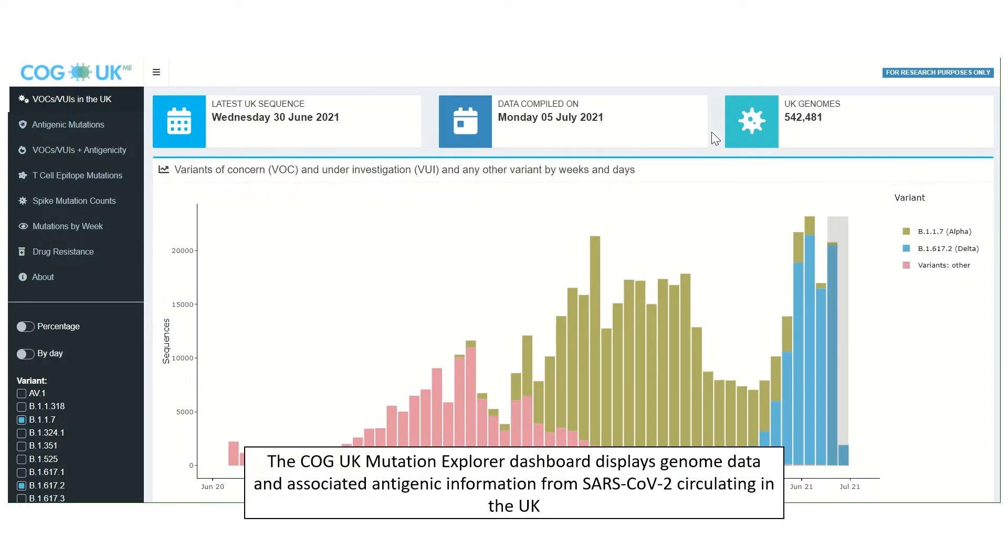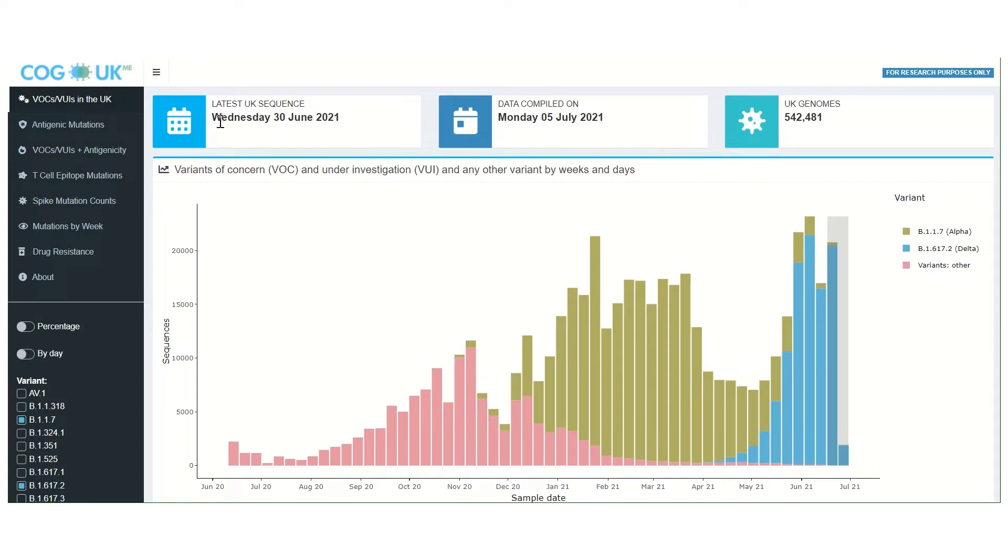The COG-UK Mutation Explorer dashboard displays genome data and associated antigenic information from SARS-CoV-2 circulating in the UK. Daily sequence data updates are summarized in the info boxes at the top of the page.